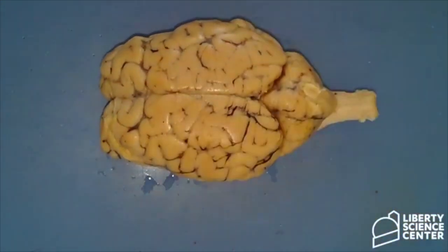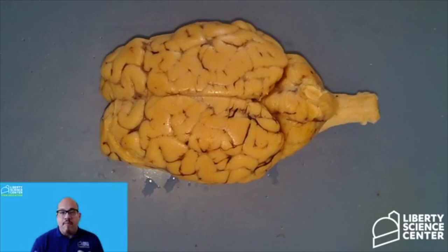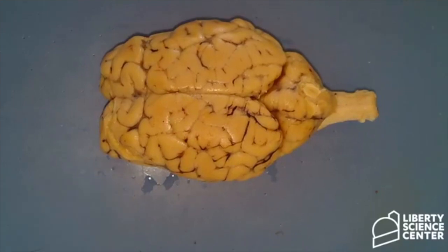All right, so we mentioned lobes. I'm going to give you some idea of where the lobes are, because when it comes to brain dissections, you'll notice that a lot of the structures look very similar to one another. So I will do my best to differentiate for you all. Okay, so let's go back to our brain.